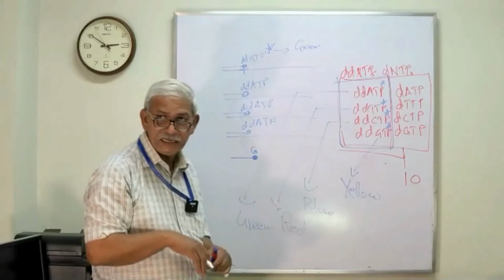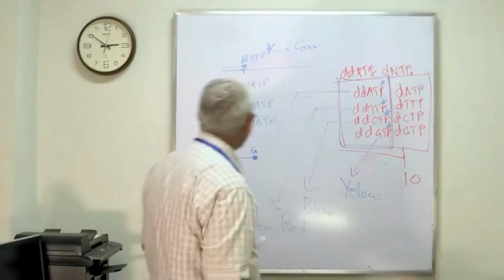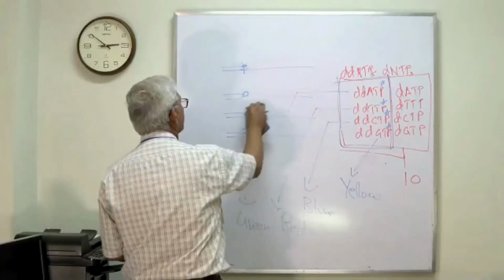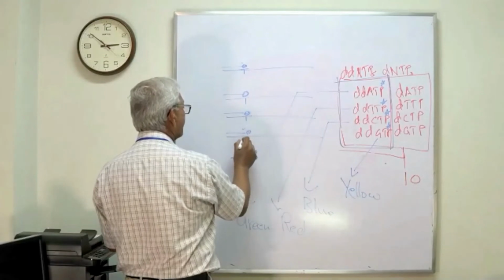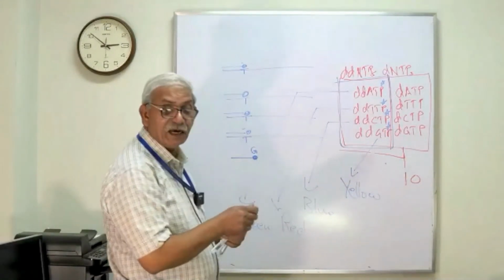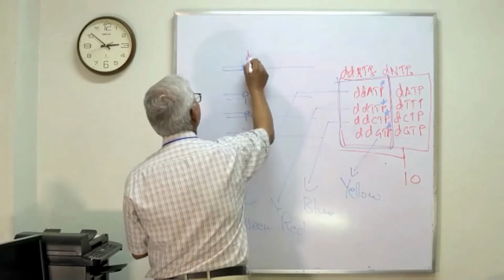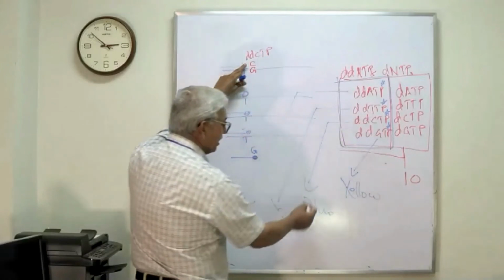Okay. Now there are many other fragments which will not get dideoxy ATP, so the chain elongation will continue to the second nucleotide. Now, you knew that there is a T here because these are identical DNA strands. So all have T at that position. Suppose there is a G after T on the template strand. What will be added here? C will be added here, right? And if this is a dideoxy CTP, what is the color of C? CTP is blue. Okay.